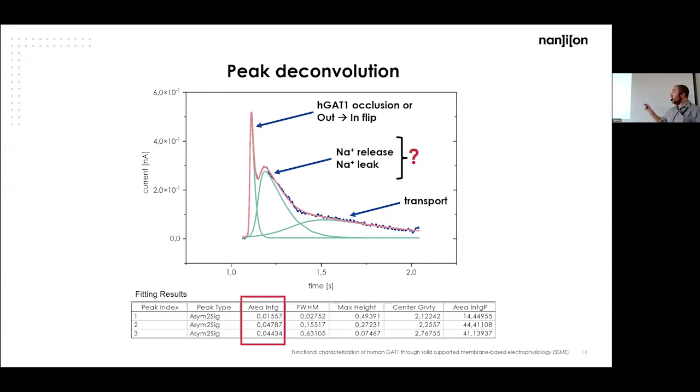So the first peak is very similar to a process that has been observed in patch clamp in literature. They managed to achieve a fast solution exchange by using photocaged GABA and a pulse of light to free this GABA very quickly in the solution. And both rise time and decay time of this peak are very consistent with the ones that this guy found.